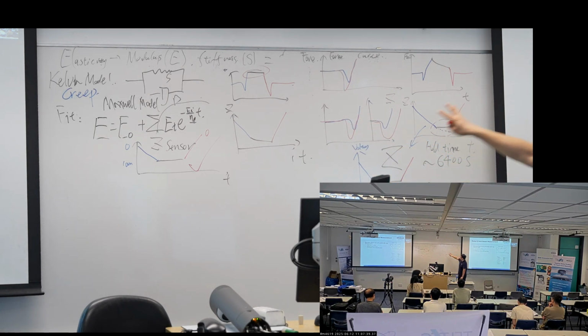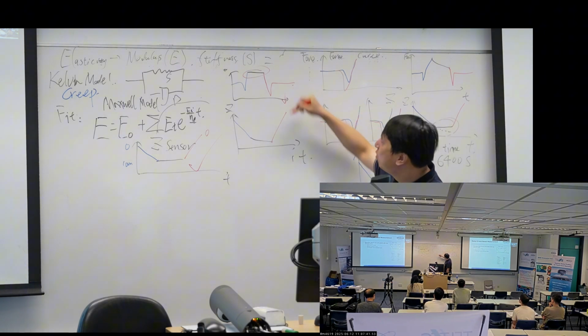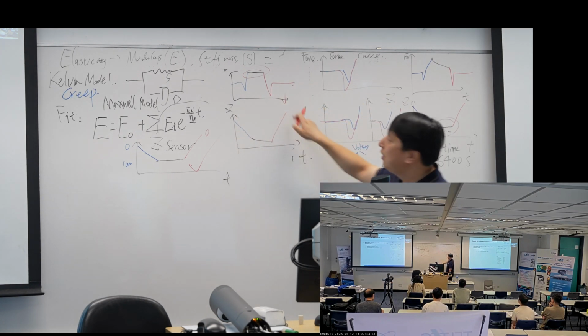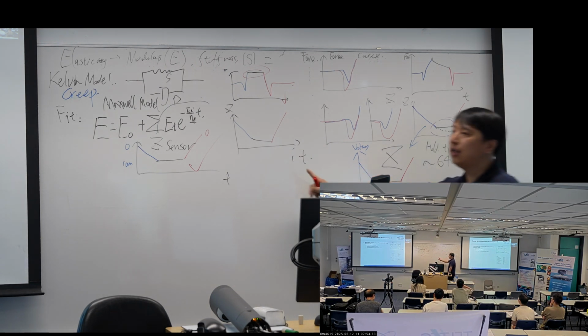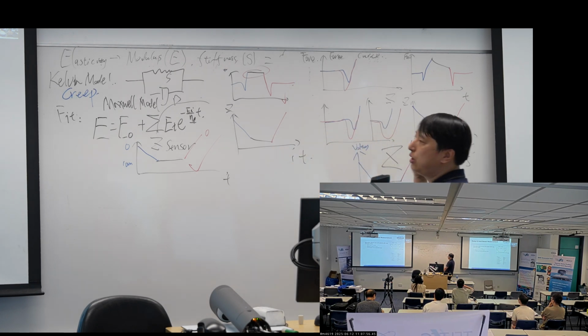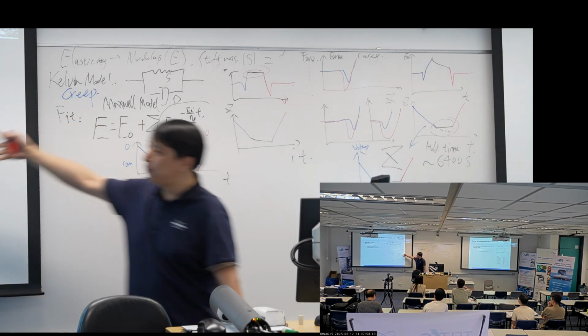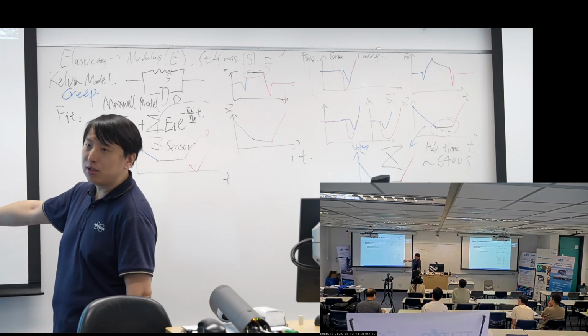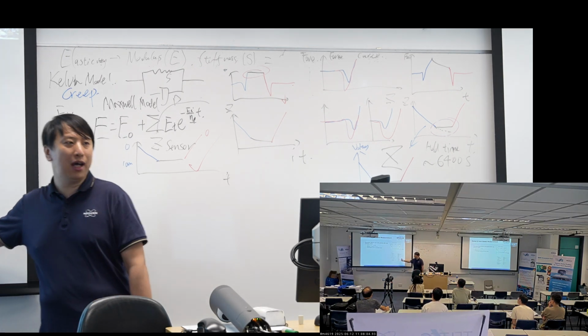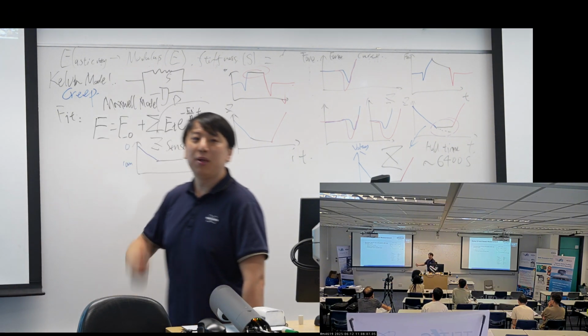Or if you don't like this kind of force curves, you can watch the force and the Z against time. It's okay. The software can give you both. Yeah, that's about the creep. And the creep setup is similar to the relaxation. We have the force curve part. We have the surface control part. And for the surface control part, we just type in time and the samples. How many points do you want to capture?